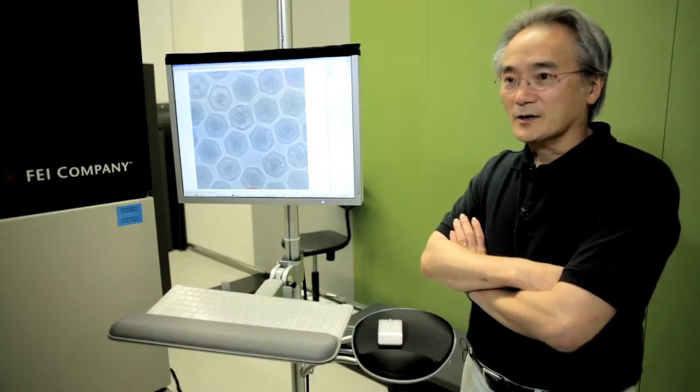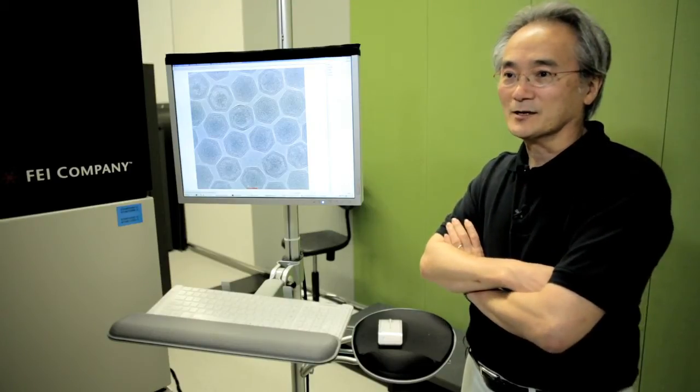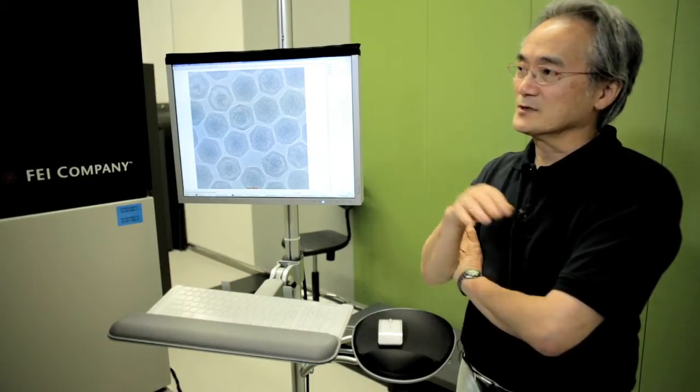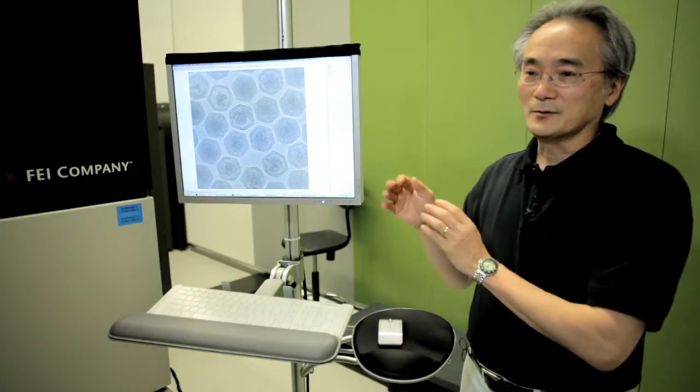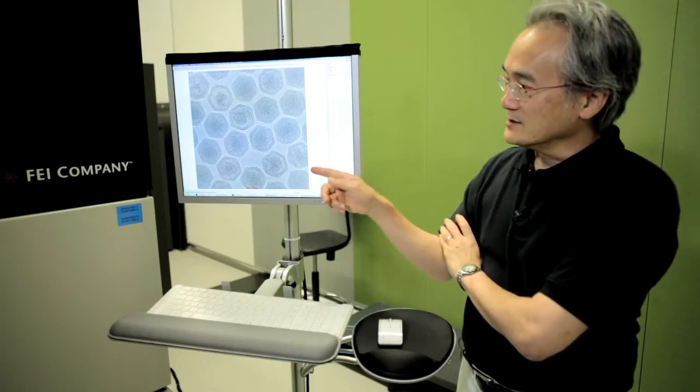One reason why I came to Singapore was because I wanted to do something that I couldn't do at MIT. It wasn't just this microscope that was the attractant, but it was the possibility of being able to see what something like dengue virus does. The key word here is dynamics. We want to see it in action.